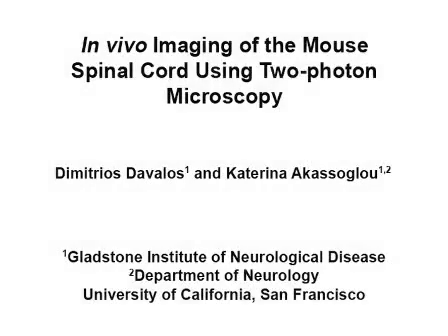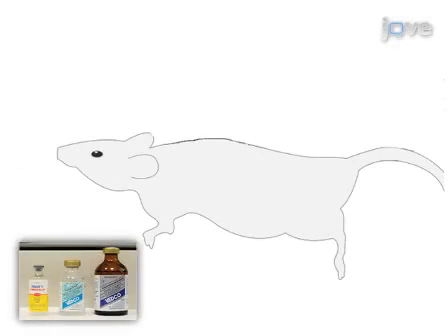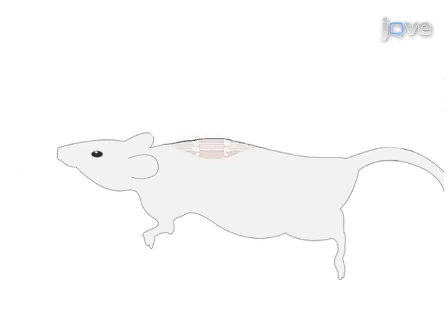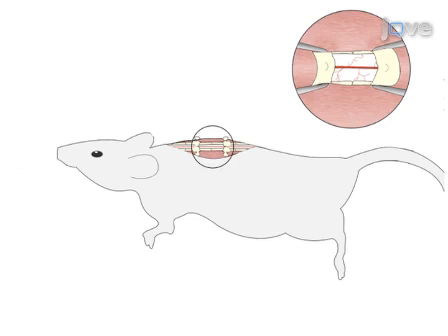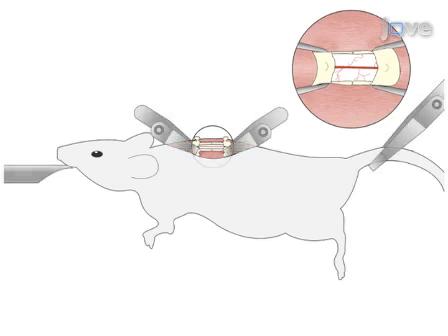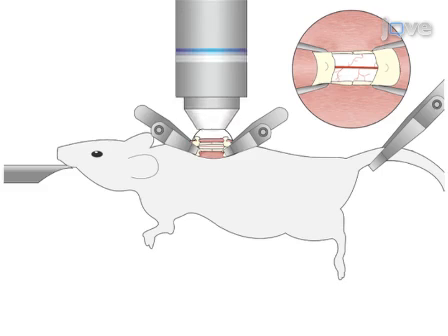The goal of this procedure is to perform stable in vivo imaging in the mouse spinal cord using two photon microscopy. This is accomplished by first anesthetizing the animal with an anesthetic mix that achieves a steady yet calm breathing rhythm. The second step is to expose the spinal column at the desired level and perform a laminectomy to expose the underlying spinal cord for in vivo imaging. The third step is to place the animal on the spinal stabilization device. The final step is the isolation of the exposed spinal cord segment in preparation for in vivo imaging.